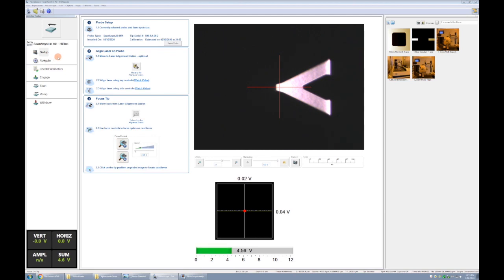Then drive the scanner until it's one millimeter above the sample, and then we'll go over the parameters that are involved with AFM scanning. In the following video we'll actually engage the sample and do some scanning.